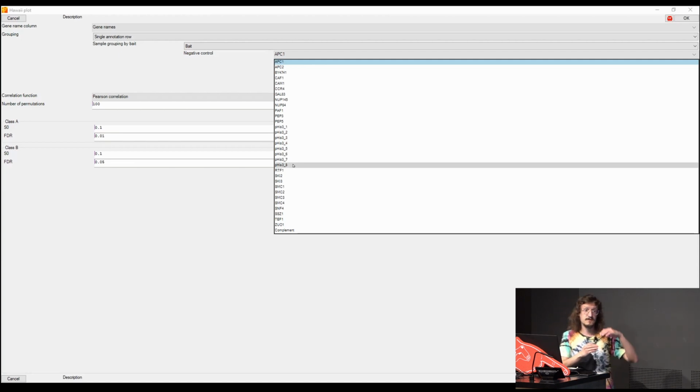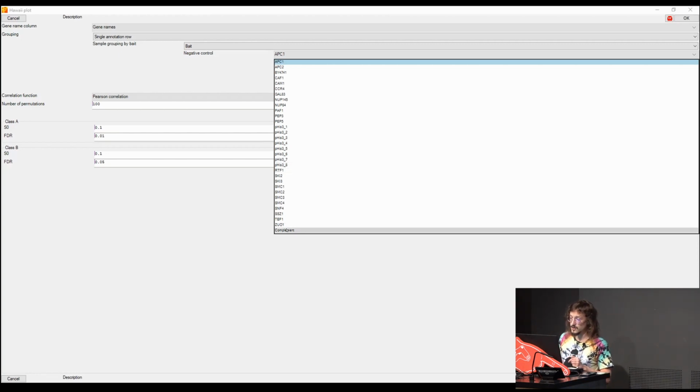And you will see then that the significance will drastically increase the more data you have. But we're not going to do that. We're going to use the complement. And the complement is the information coming from the whole data set. So now we will plot the significant ones. We will plot one condition against the LFQ results coming from all the others. So it means the information coming from the unspecific binders from all baits and all the experiments that were done.